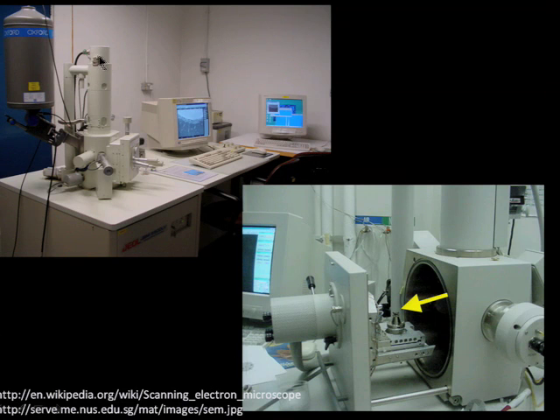And here's a picture of a typical scanning electron microscope, an SEM. Up here, we have the electron emitter, and this is the column with the optics and the scanning coils. Your sample typically sits in this chamber, and you can see it's on this little post here. This is big and husky because it operates in vacuum. You couldn't get such accuracy with an electron beam if you had it in air, because air would scatter the electrons. So there is a constraint of the technique in that your sample has to be vacuum compatible.